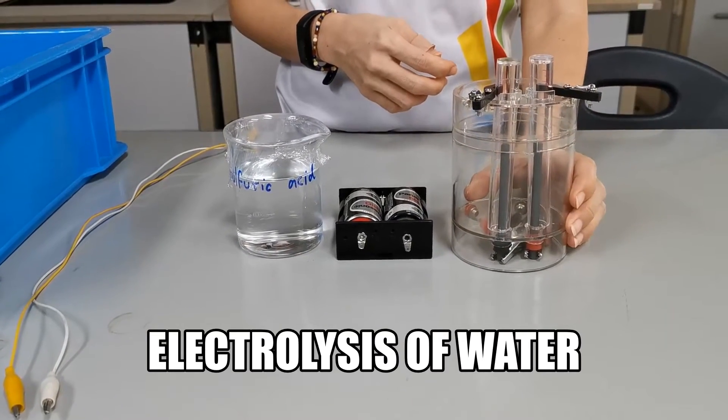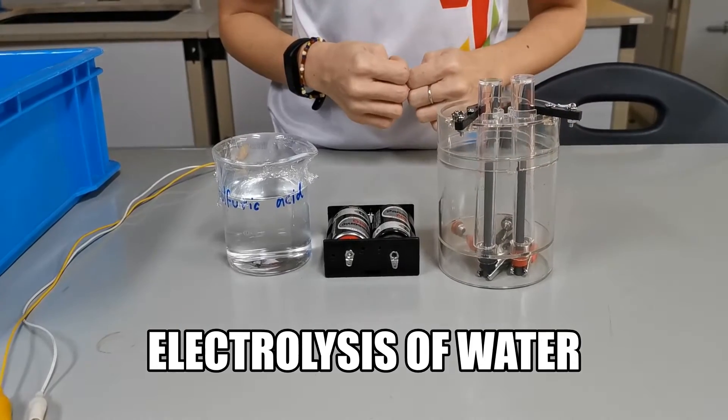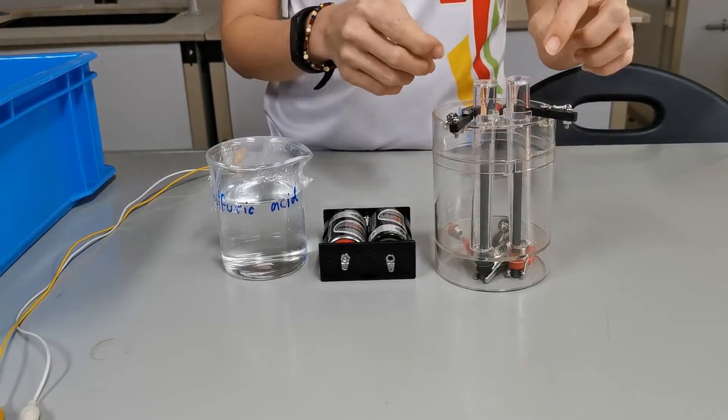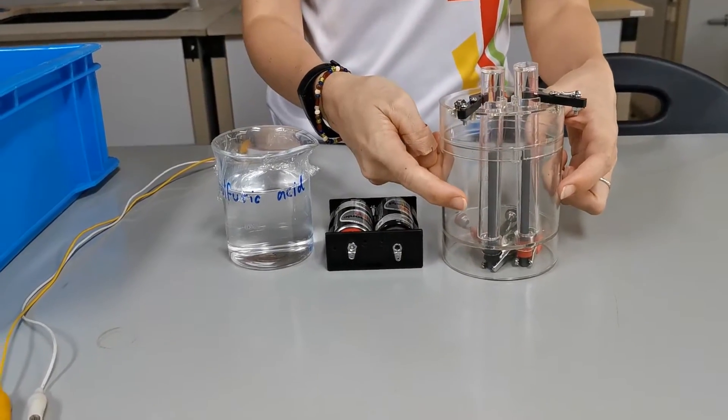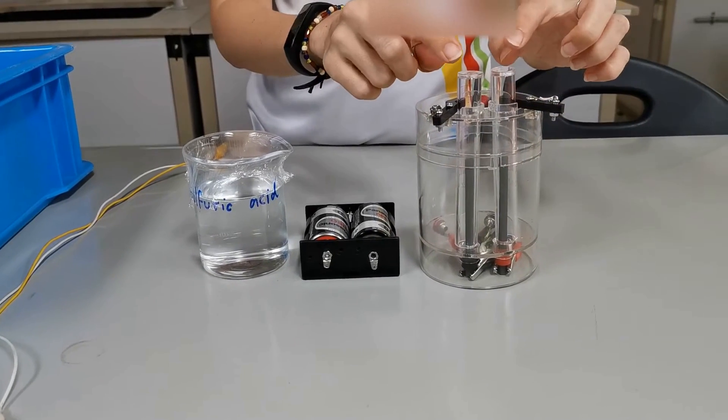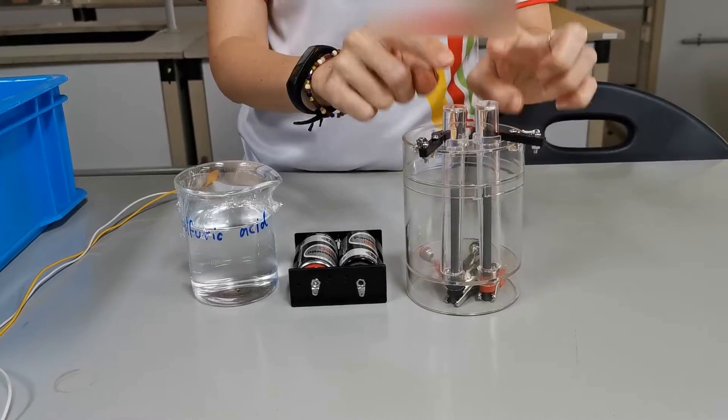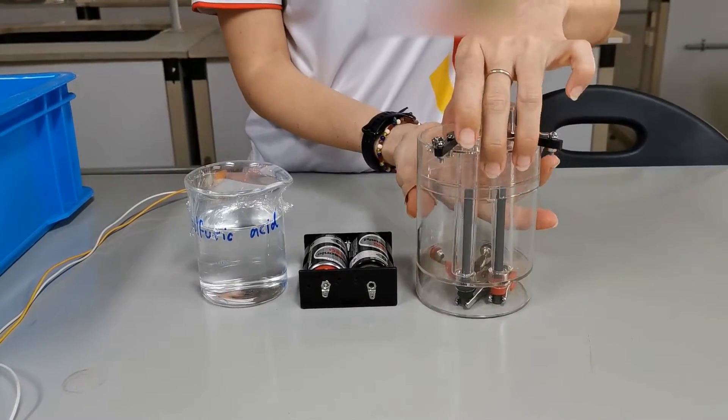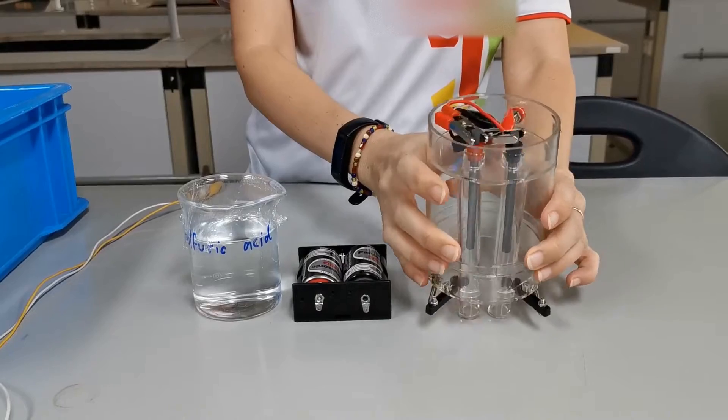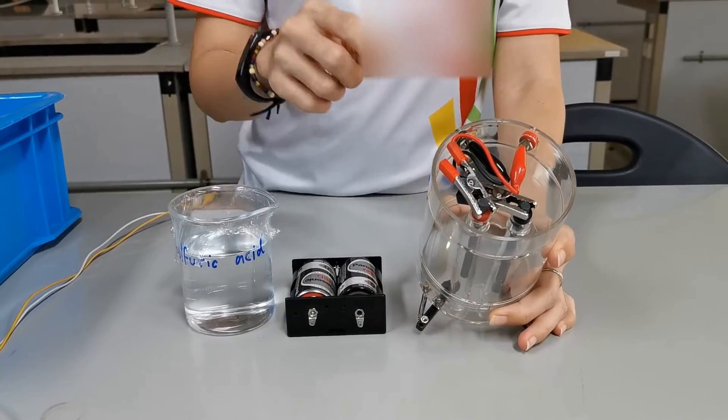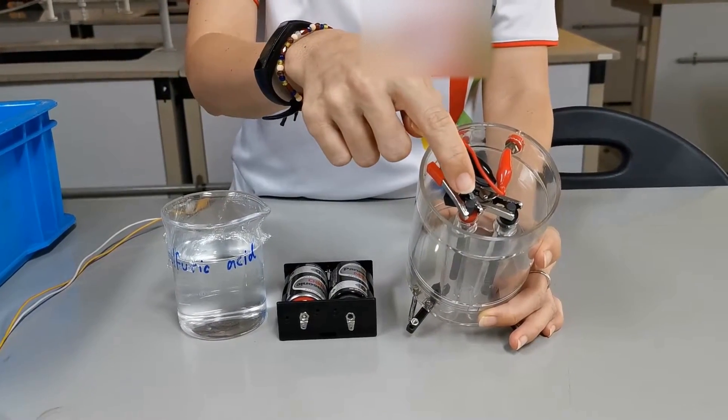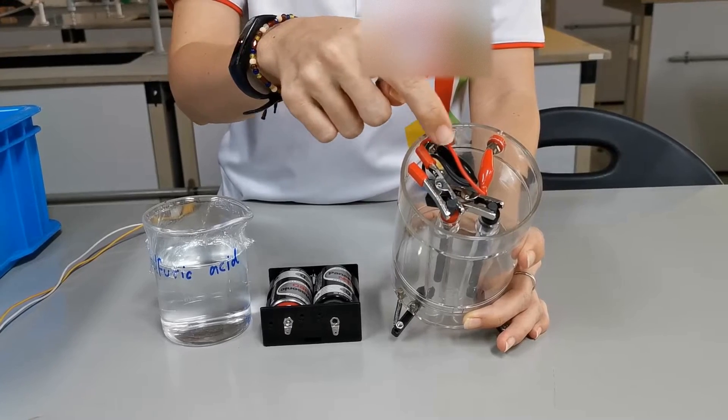This device is used for electrolysis of water. We have two carbon electrodes here and two tubes to capture and measure the volume of gases produced. At the bottom here we have the carbon electrode connected to a metal piece.